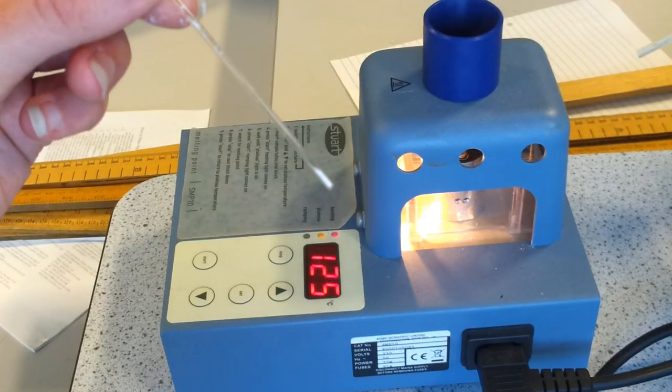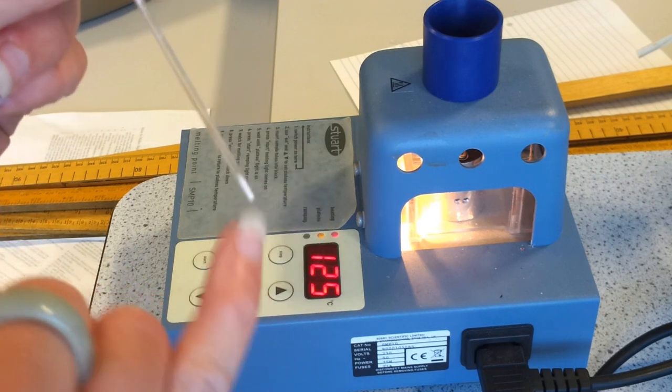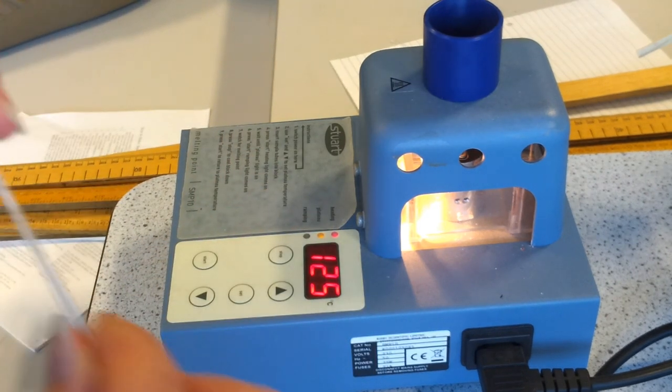There we go, you can just about see white powder at the bottom now, so that's our aspirin at the bottom of the capillary tube.